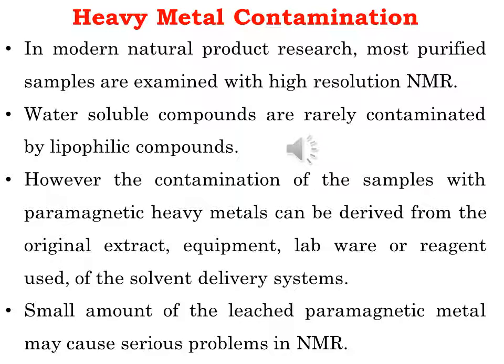About 10 years ago, some authors wrote a guide for the purification of marine natural products with the emphasis on water-soluble compounds. So in this lecture, we are going to discuss the methods, or the general procedure, that can be used for the extraction or purification of water-soluble small molecules.